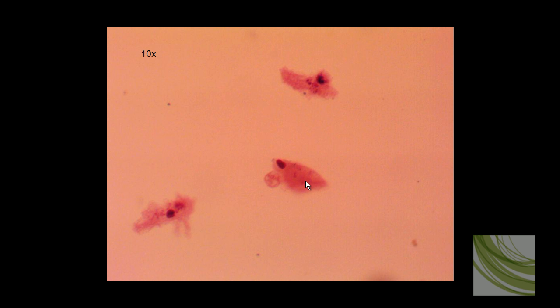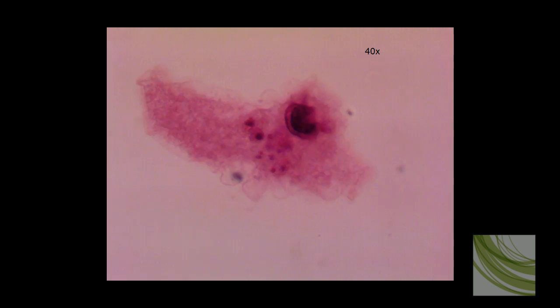Here is one of our amoeba that we have focused in on using the 40x objective. We can see the nucleus and we can see several food or even waste vacuoles mixed into the cytoplasm.